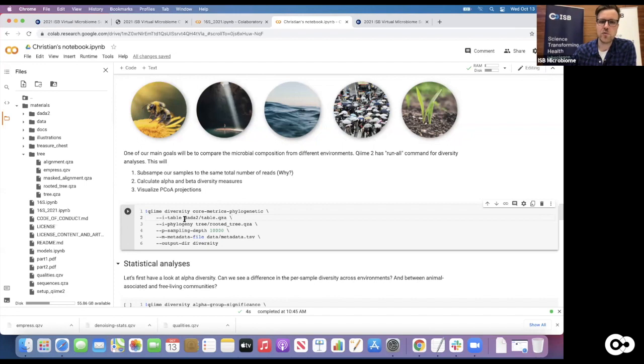If you get more reads from a particular environment, it doesn't necessarily mean there's more DNA in there. That can still happen even if it isn't. So it's a bit unclear what that means. Usually you want to account for that. There are several approaches and all are kind of not perfect. The one that QIIME 2 uses here is called subsampling.